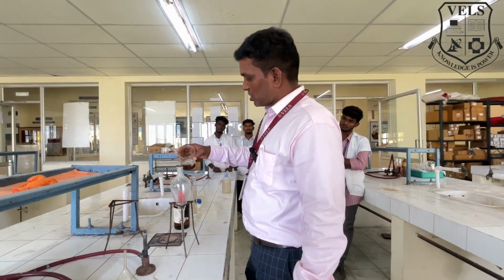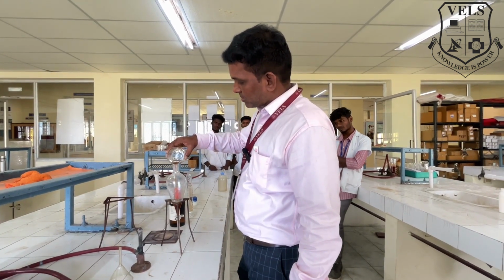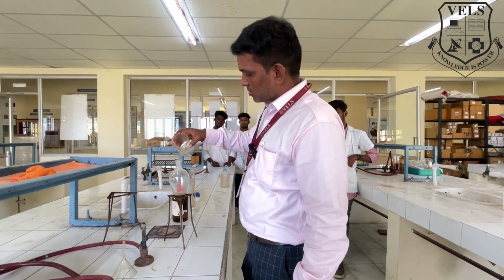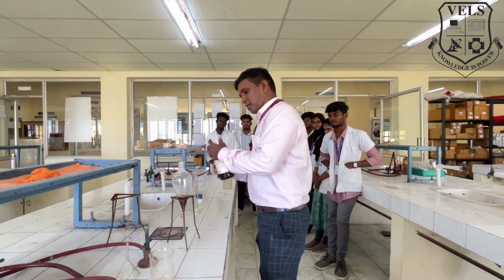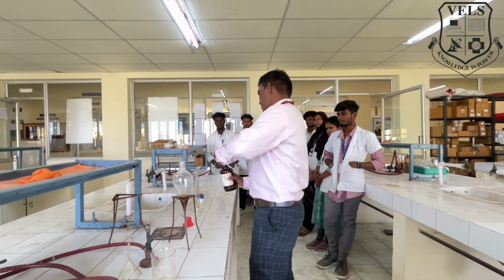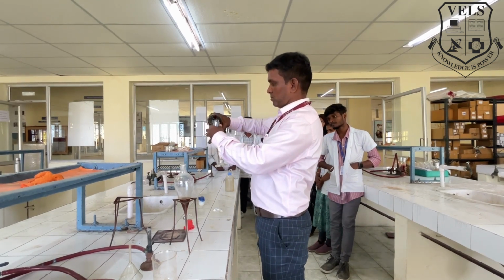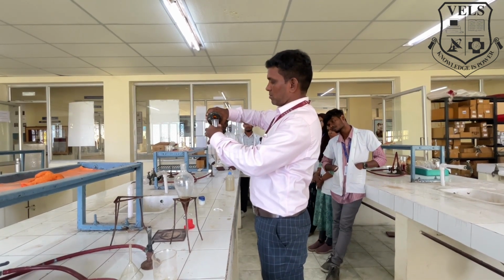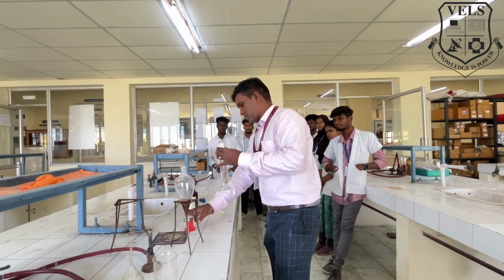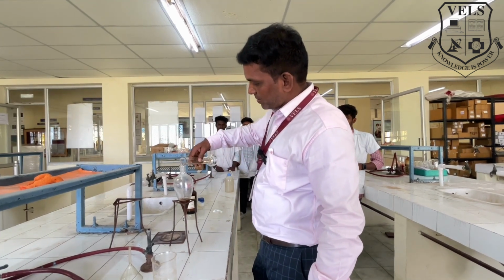I am going to add this into the separating funnel. Take 50 ml of chloroform and add it into this separating funnel.